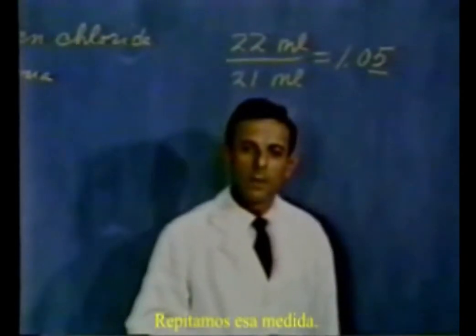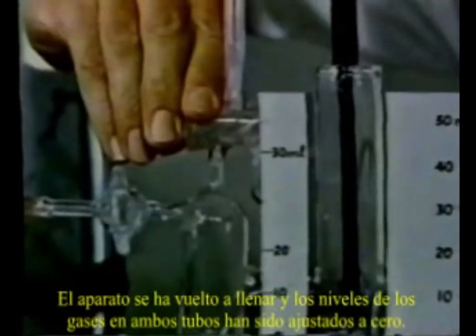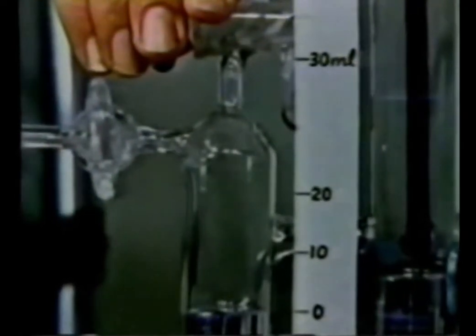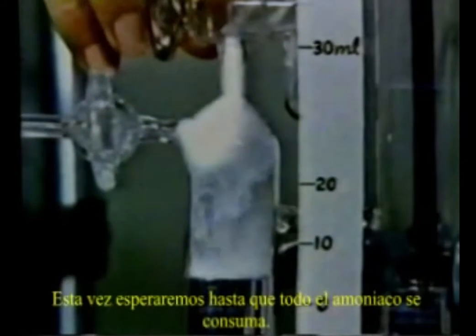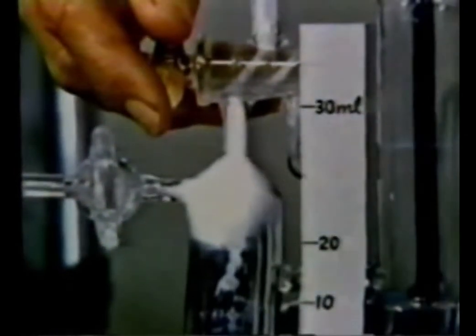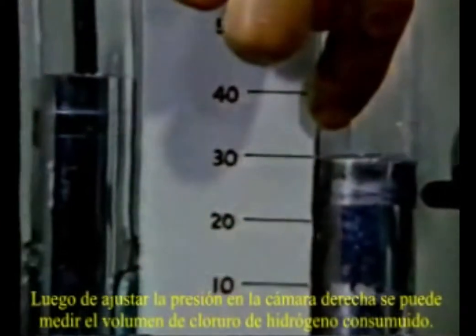Now let's repeat that measurement. The apparatus has been refilled and the levels of the two gases again adjusted to 0. This time, let's wait until all of the ammonia is consumed. After adjusting the leveling bulb on the right, we can see how much hydrogen chloride was needed.